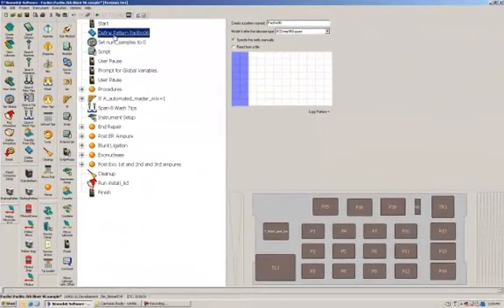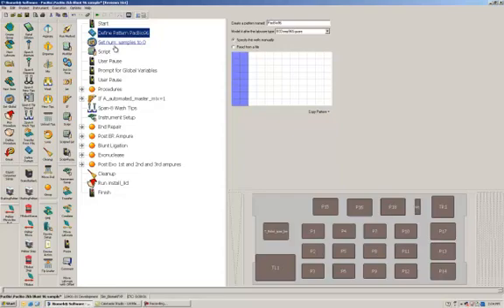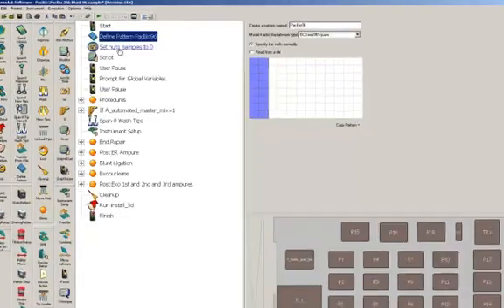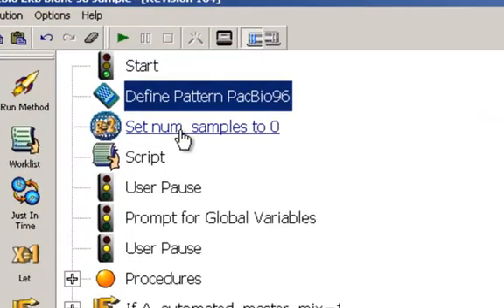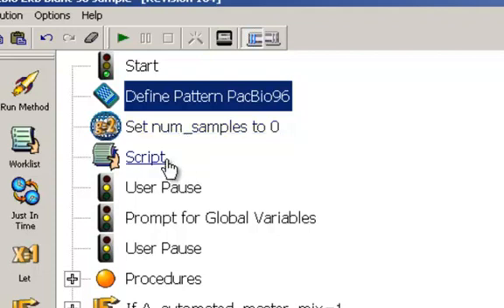After we define where the samples are in the plate, the next two steps in the method basically just create a global variable that keeps track of the number of samples and the script step basically counts the number of wells in your pattern and sets that global variable to that number of samples.